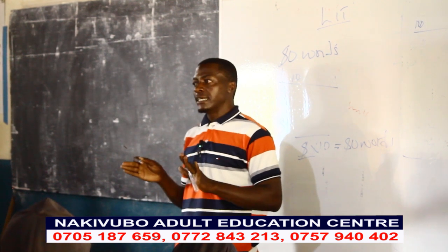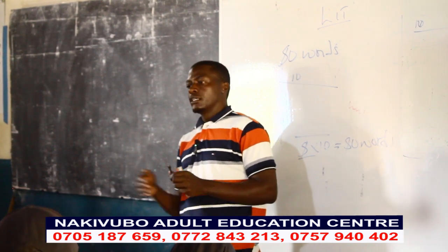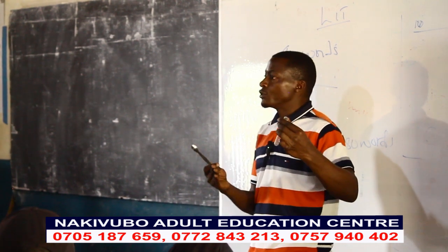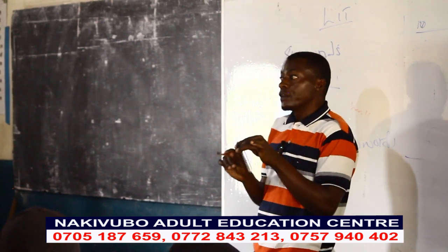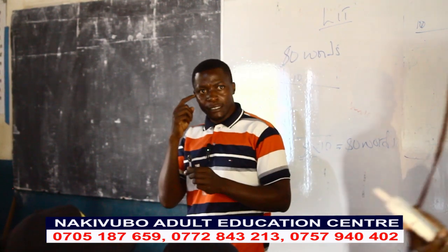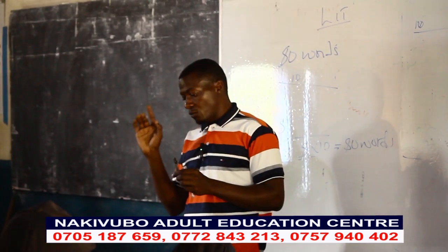Your neighbor may bring a mixture. One can dissolve, another one doesn't dissolve. They tell you to go and dissolve, you see the substance is not dissolving. Yes, there is one which is dissolving, and another one which is not. But what you need to put in mind, when we are dissolving, I can dissolve using an acid, and I can also dissolve using water.